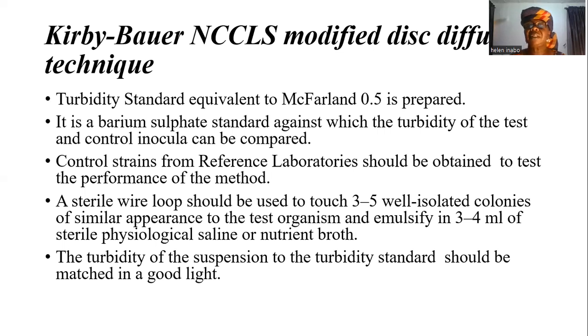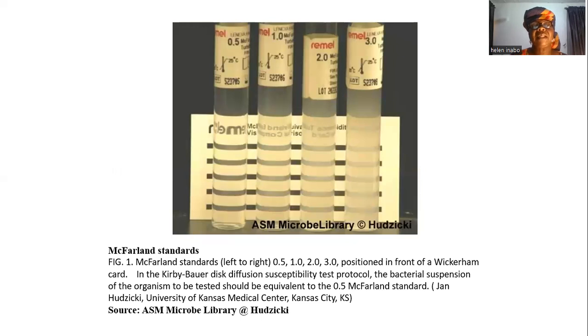Now, the turbidity of this bacterial suspension should be matched in a good light to this turbidity standard. That is the barium sulfate standard. Here is an example of McFarland standard prepared, specifically McFarland 0.5, which is used in this technique.